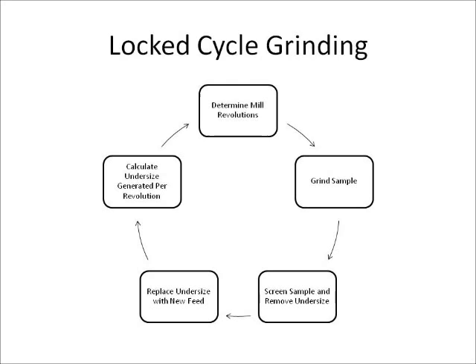Once the initial sample has been prepared, the ore charge is added to the bond ball mill. The initial number of mill revolutions is not calculated but selected and ranges from between 150 to 250 revolutions. While crushing the sample, you can usually get a feeling for how hard the material is. If a sample is known to be hard, it is better to select a higher number of initial revolutions, as a harder material requires more mill revolutions than a softer material to obtain the target weight for the undersize. And it may also decrease the amount of cycles required for the test to reach a continuous state.